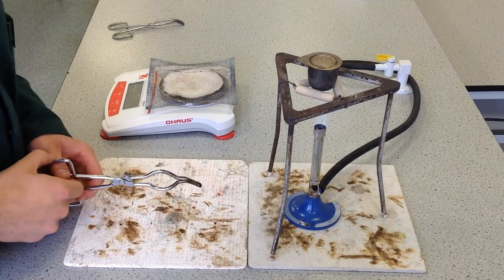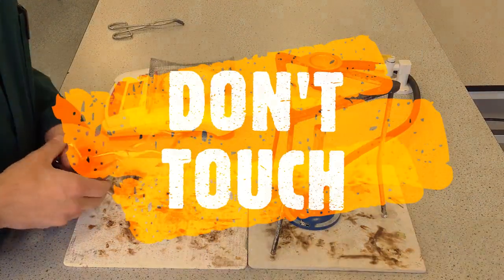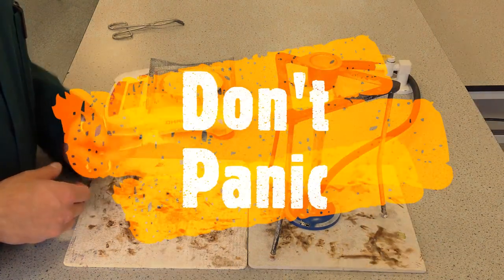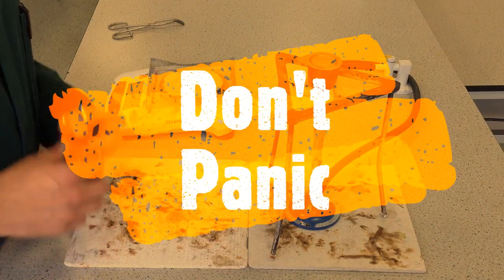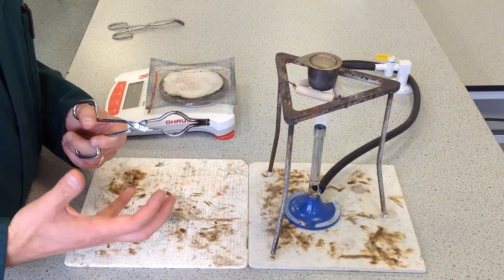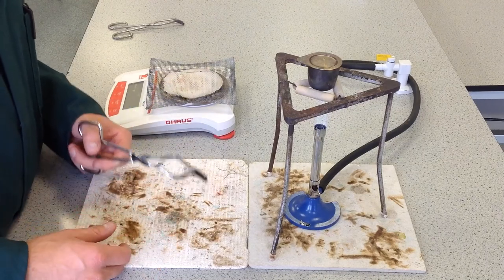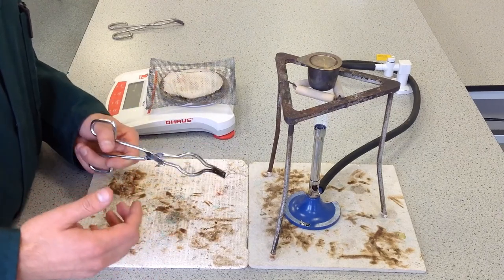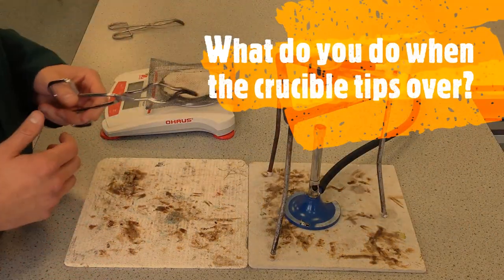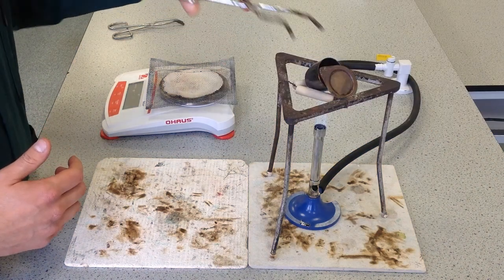Finally, a few things about what to do if things go wrong. The first and most important piece of advice is not to touch the crucible with your hands. The second is not to panic — you're not really time-limited. If you make a mistake, don't feel you have to solve it immediately. Be calm, go through the steps carefully, ask for help if needed, and that's how you'll stay safe. Let's imagine you've gone to pick up the crucible and have dropped it.